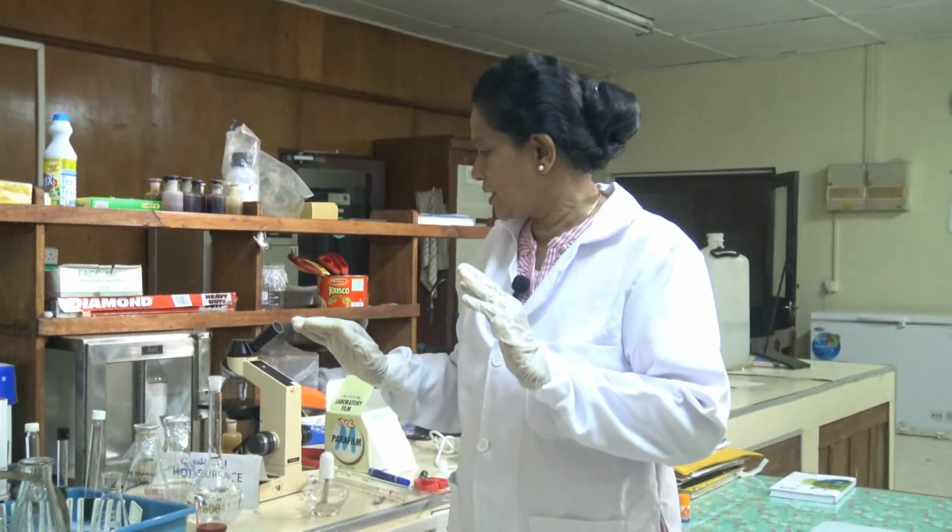So, when handling chemicals and when handling glassware, if you have these things in your mind, you can work smoothly and always think that not only you work in the lab, there are so many people working there, so you have to maintain your safety as well as other people's safety. Thank you.